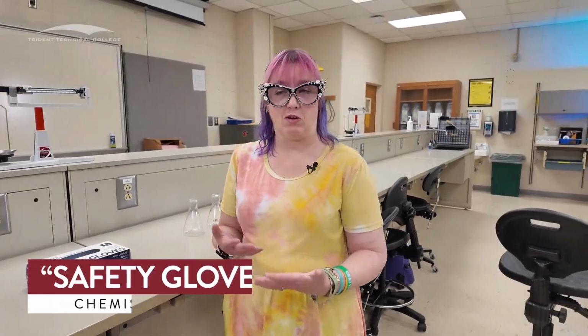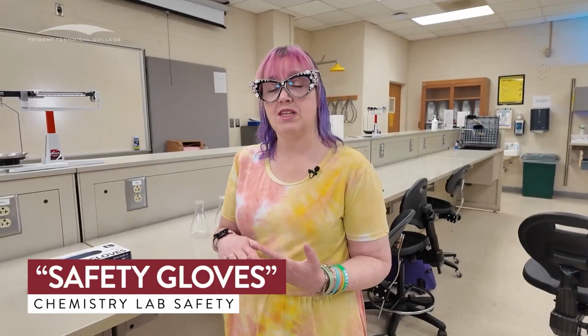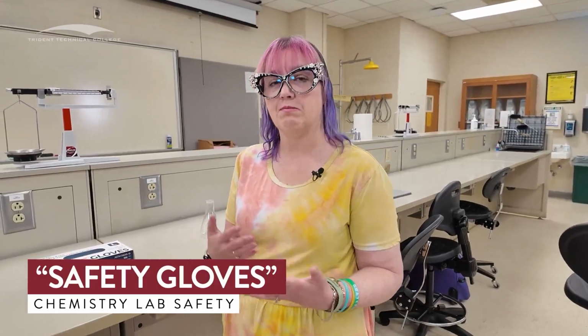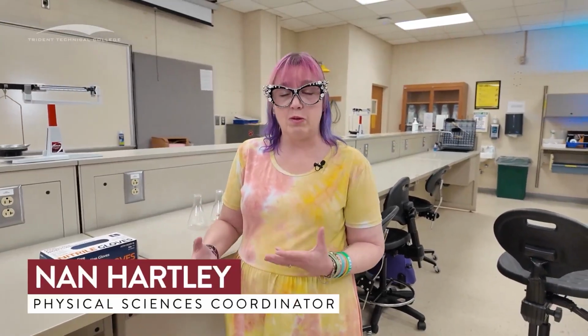So we've got a couple of experiments where we specifically need to be worried about our glove protocols. And those experiments are the solution concentration, the titration standardization, and the titration for the vinegar concentration. So when we talk about those experiments, it's absolutely necessary that we wear gloves for the entire experiments. For the other experiments, gloves are recommended. They're not necessarily necessary. It's never that we don't want you to wear them, but you don't have to wear them for the other experiments. For these, it's necessary. So I want to show you how to properly put on a pair of gloves, how to take them off, and then talk about what are proper protocols for using those gloves in those experiments.